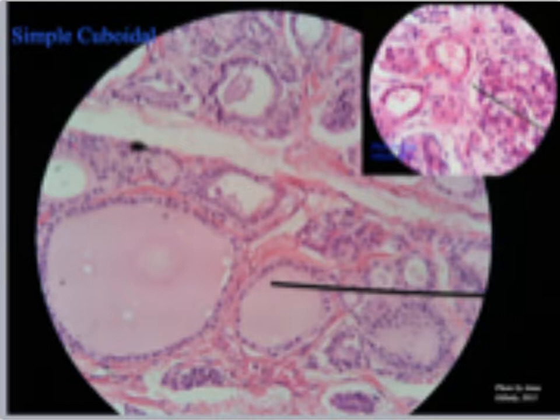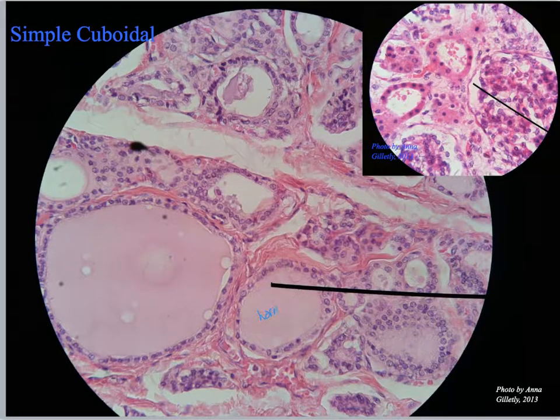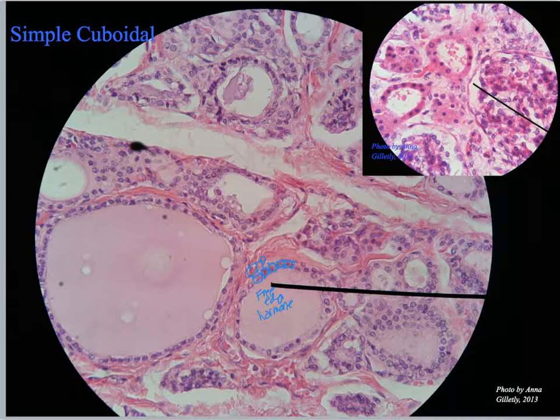Here's an example of a slide we would see in the lab. I have a follicle with some kind of hormone inside it. This is a free edge. Over here is my connective tissue proper, and I can see I have a single row of cube-shaped cells — so I have simple cuboidal epithelium. I want to contrast this with the slide up here. When you are looking at tissue slides, almost never will you have only one type of tissue present. Here I can see simple squamous, and right next to it I have a tube where I've got simple cuboidal.